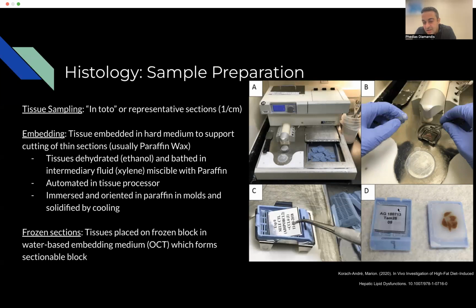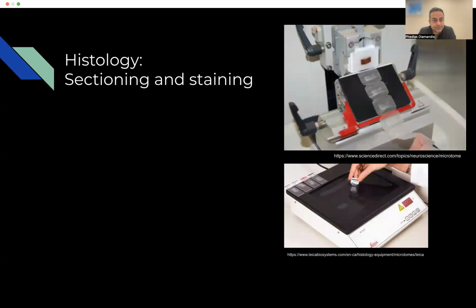So on one side you have the specimen label. You can also write it here, which is actually just engraved on in a modern workflow with a computer, and then you have the frozen wax from the mold that has the tissue oriented in the correct position that you'd want the tissue section.